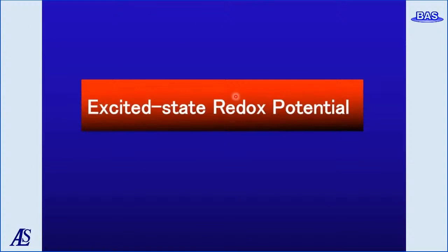In these studies, it is important to determine the potentials of the complex which is excited by light. So, today's seminar is focusing on how to determine the excited state redox potentials.